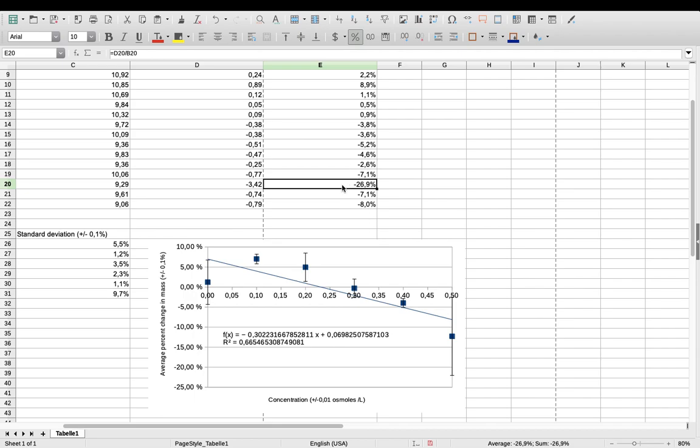That being said, whenever you decide to leave a data point out of your calculations, you need to declare that, A, you've done that, you've decided to exclude this from your calculations, and B, you need to justify why you've done that. Now, if you have some plausible explanation why you think this was a mistake, you can include that in your analysis. And this would also go in the analysis portion.